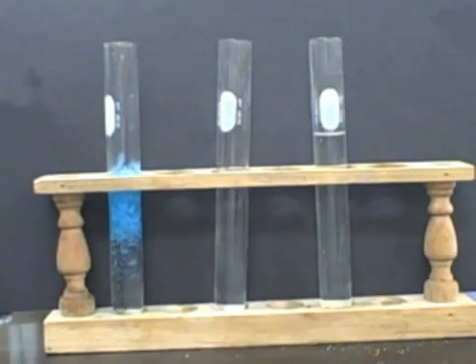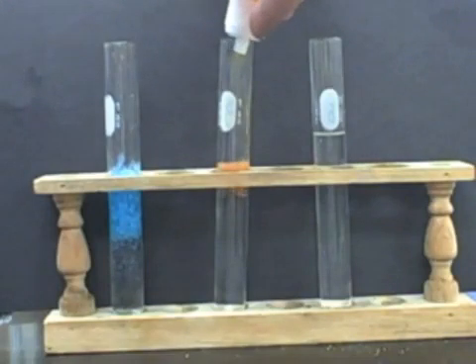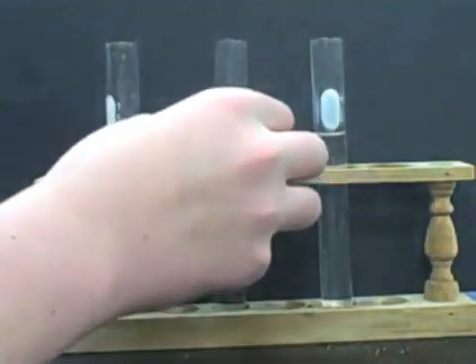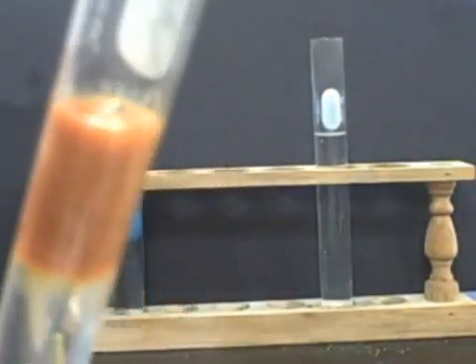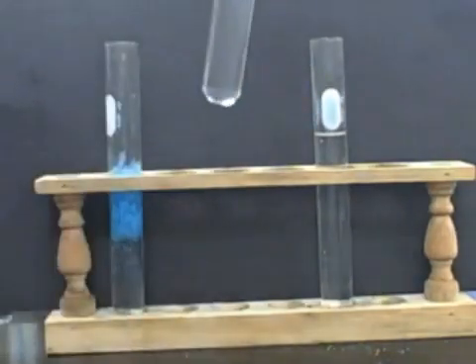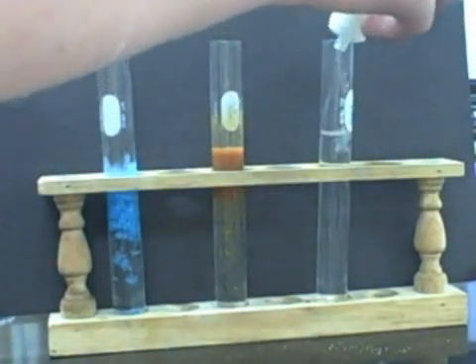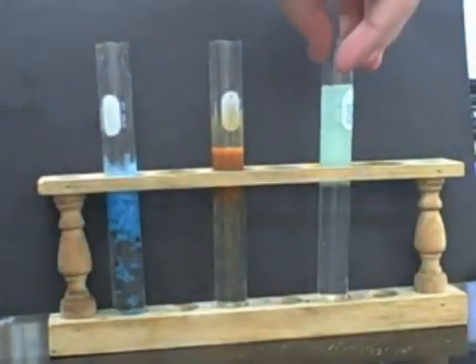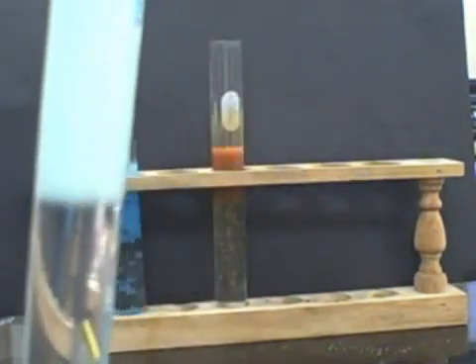And then we've got iron chloride, and adding that to our solution of sodium carbonate. It's actually, wow, look at that. You can see our nice precipitate there. So here's nickel chloride and sodium carbonate. Nice light blue-green color there. As you can see, these are similar to the hydroxides.